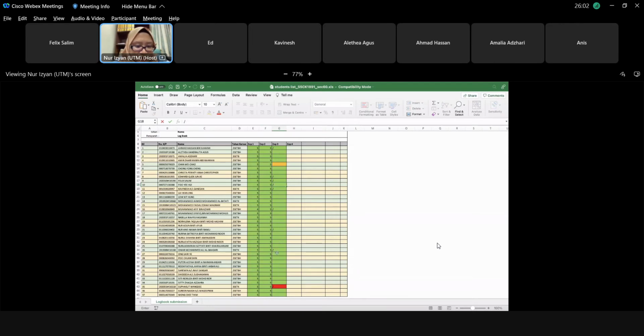Puteri Aisyah. Yes, doctor. Okay, Puteri, just now Dr. Faizwan has prepared a stock solution for the zinc sulfate. What is the concentration of the stock solution prepared?